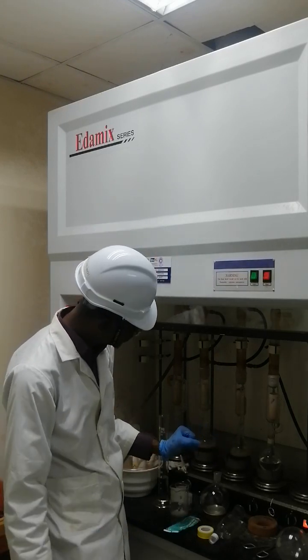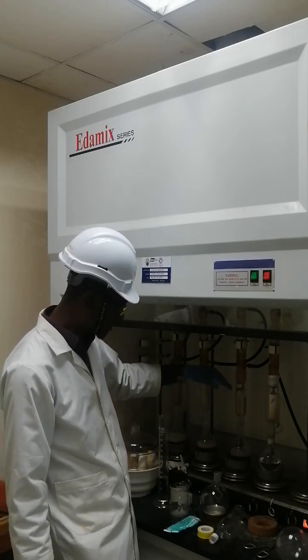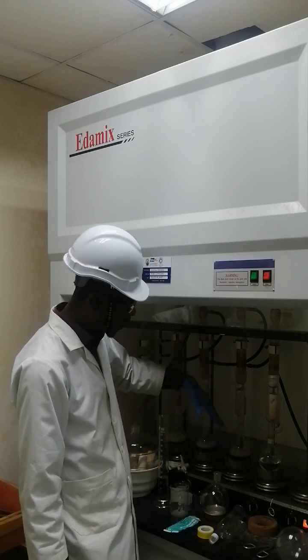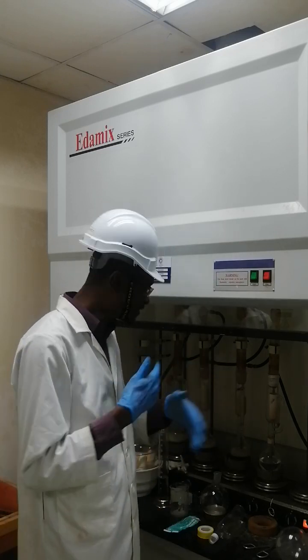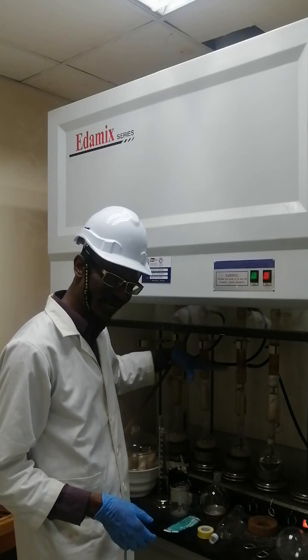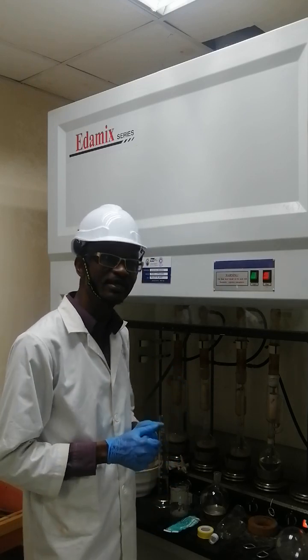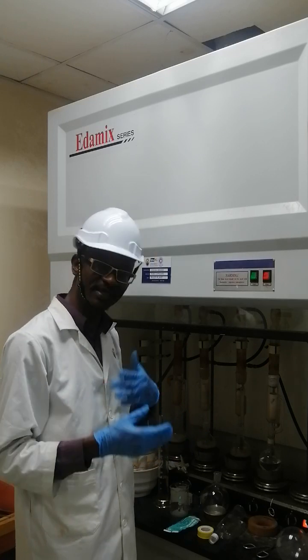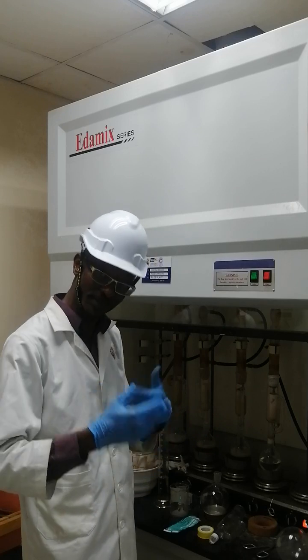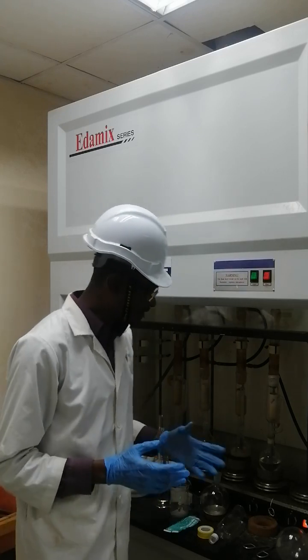So now you can see the liquid fills the extraction chamber, and then when it gets to the top, it siphons back. As it does that, the solvent that is evaporated and settling in the extraction chamber becomes clearer and clearer. So that's how you know that the component you are removing is becoming less and less, and so equilibrium is being achieved.